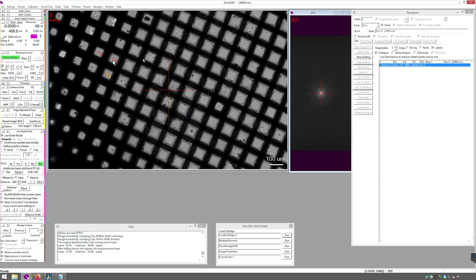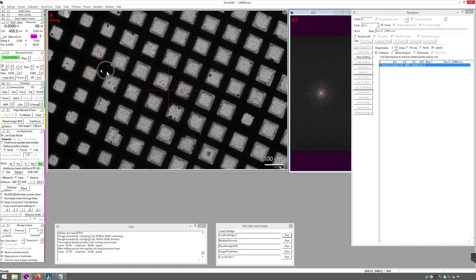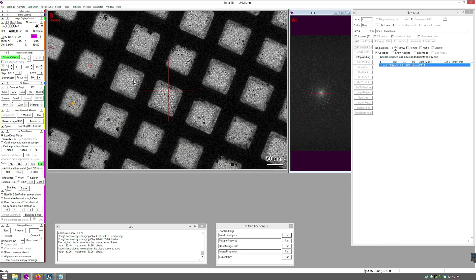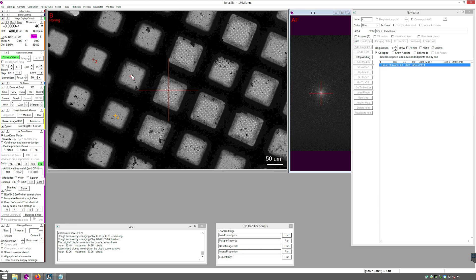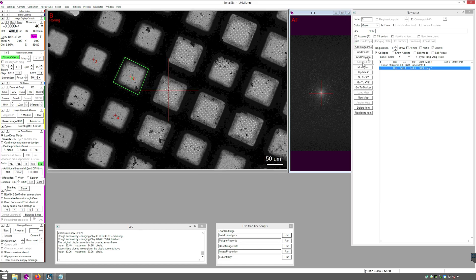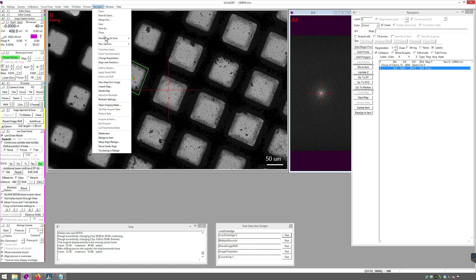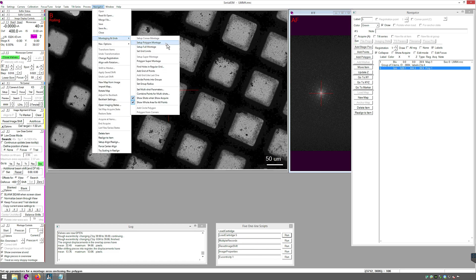Create a polygon around the largest square you have selected. The polygon tells Serial EM what size to make the medium mag montages, so making one around the largest square is useful. With the polygon created and selected in Navigator, go to Navigator Menu, Montaging and Grids, Setup Polygon Montage.